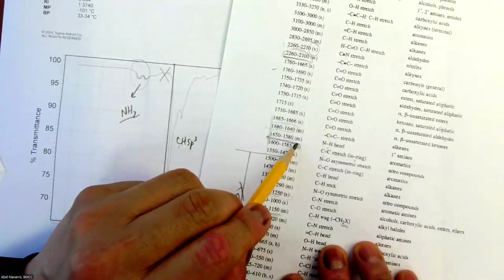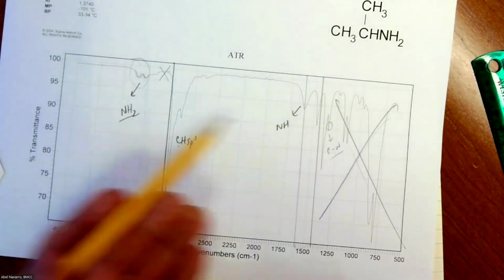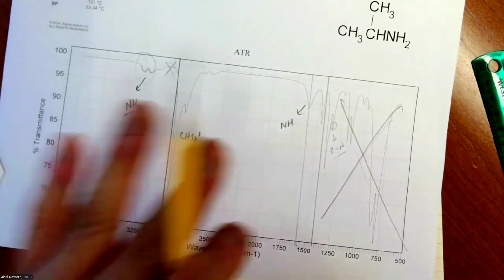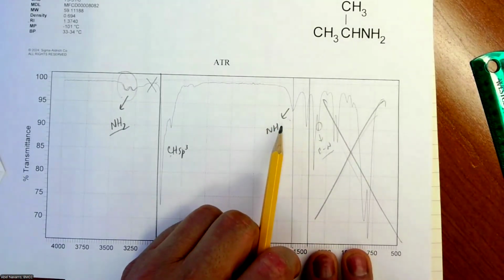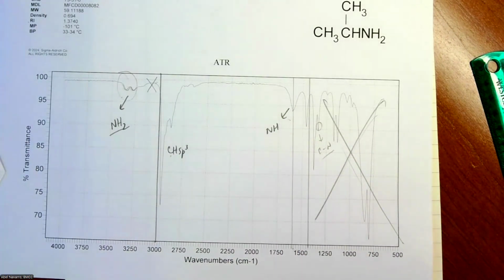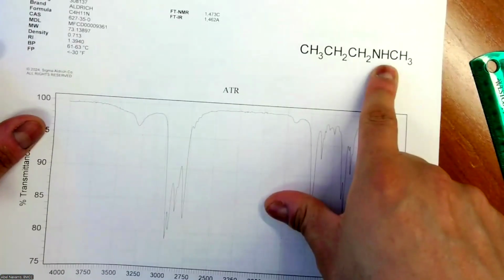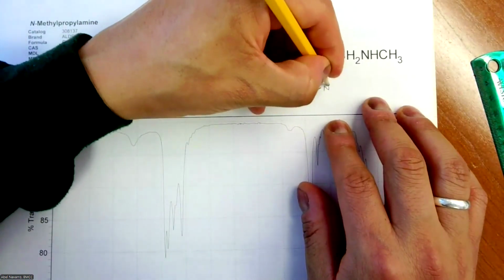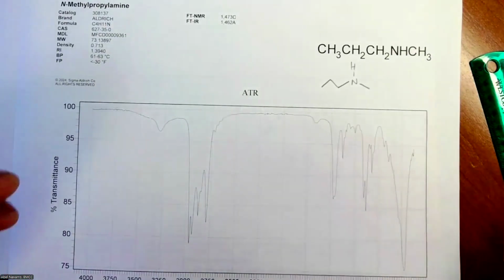Makes sense. So now, do I have to label both? No, normally this one is enough for you to determine that you have an NH present. So this one is optional. You don't have to label this as NH. But look, I just learned something with you right now. All right. So, oh, another NH. Let me see. That one is a secondary amine. See? Secondary amine. You want to see the line bond structure, 1, 2, 3, NH. Okay, that's not the structure. So that's a secondary amine, 3000 line.